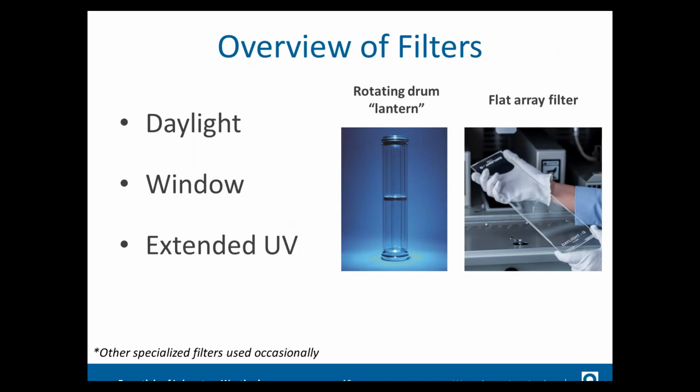So there's three types of optical filter families that are used in xenon arc tests. The first is daylight. These are designed to simulate sunlight through direct exposure. And so, that 295 cut-on that we were looking at, that noon summer sunlight, is really what we're targeting there. The next one is window. These are designed to simulate sunlight through window glass for applications in automotive interiors or storefronts.